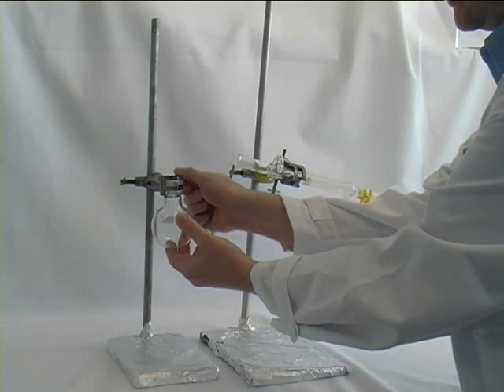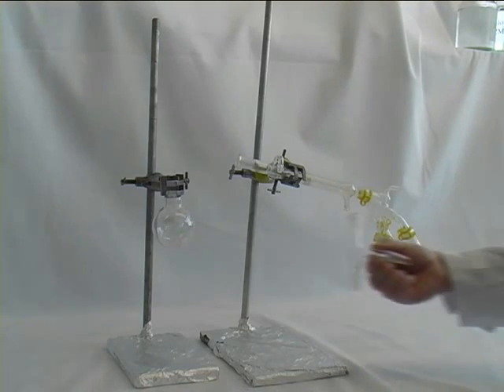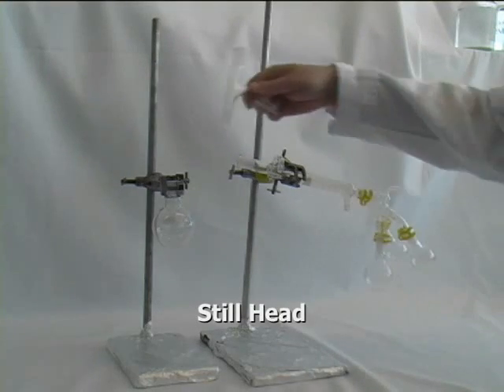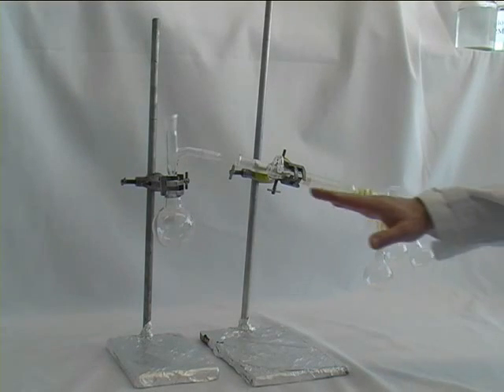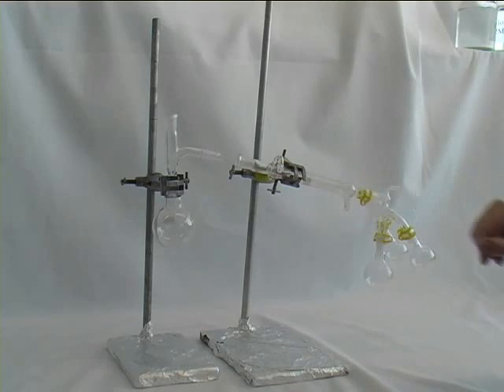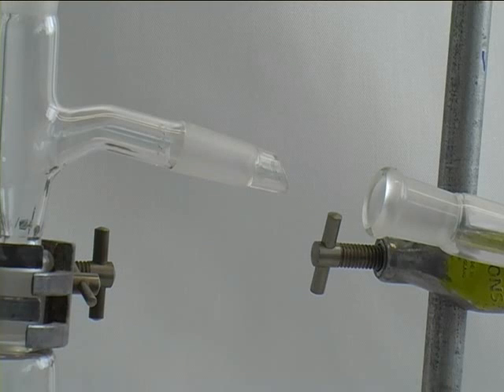On the left retort stand, we assemble now our round bottom flask. And on top of that goes the so-called still head. Now, it has to be assembled in a parallel fashion, so that the still head can be attached to the condenser easily.